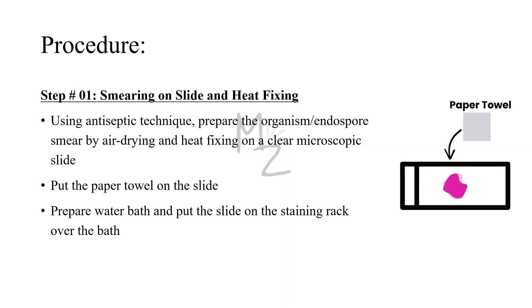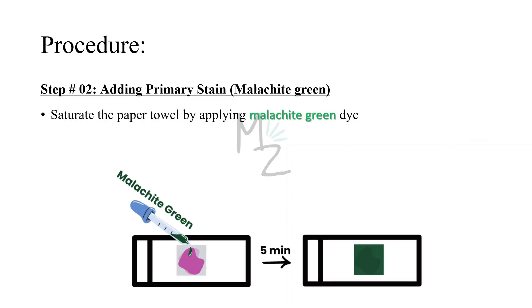Step one — smearing on slide and heat fixing: we'll use an aseptic technique to prepare the endospore smear by air drying and then heat fixing it on a clear microscopic slide. Then we'll put a paper towel on the slide to absorb excess liquid, help with drying, allow proper handling of the slide, and prevent contamination. We'll prepare the water bath and place the slide on the staining rack. Step two — adding the primary stain, malachite green: we'll saturate the paper towel by applying malachite green and leave it for five minutes.